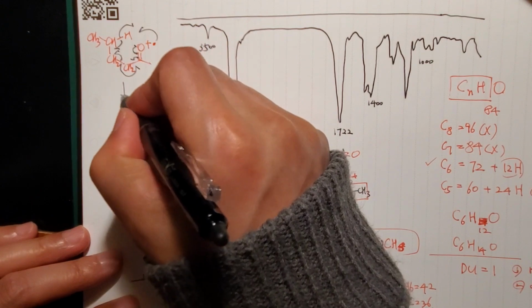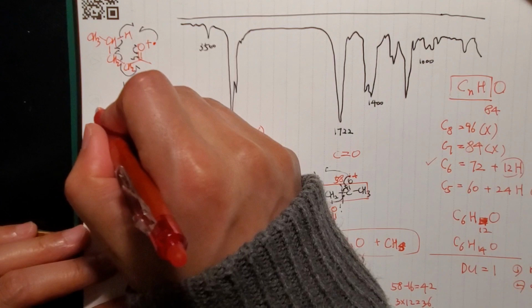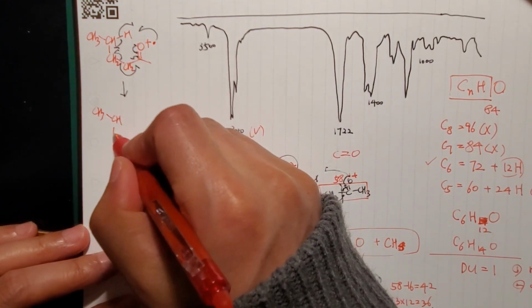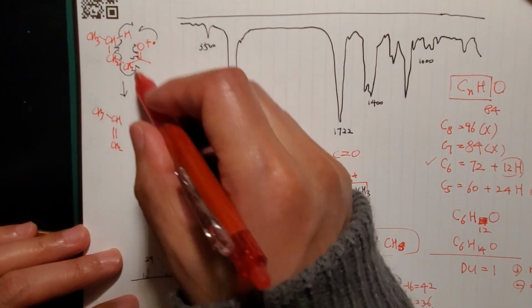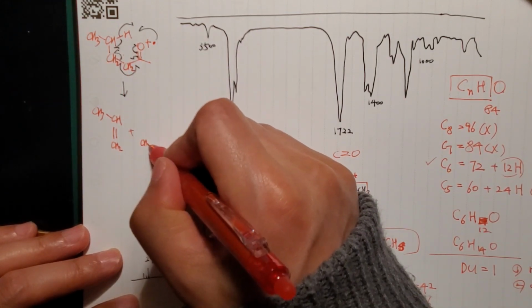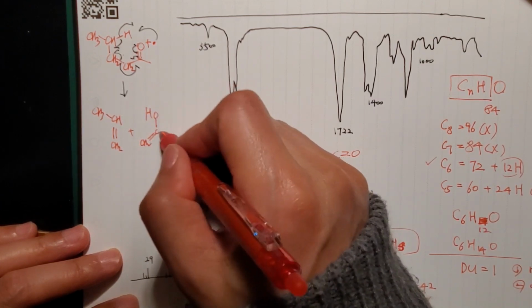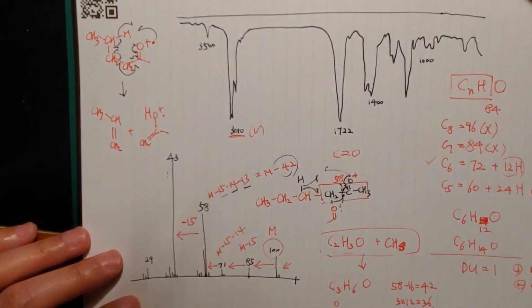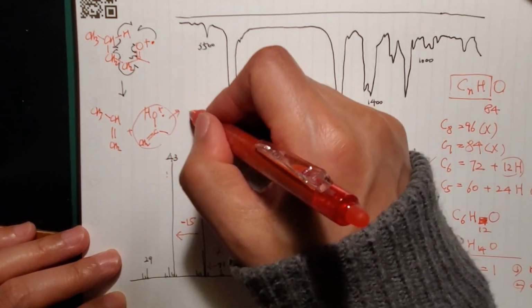Then this reaction, the intramolecular radical reaction, is giving you CH, not CH2, double bonded CH2. Then you get fragmentation right there. You break the bond, you get this double bond formed, and then OH, enol, and you get the cationic radical, and that goes to the keto form. I mentioned it before.